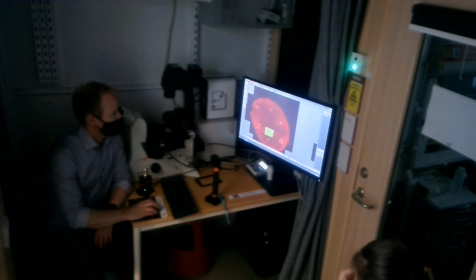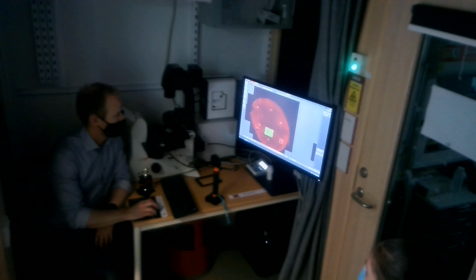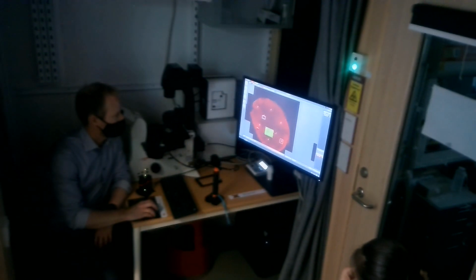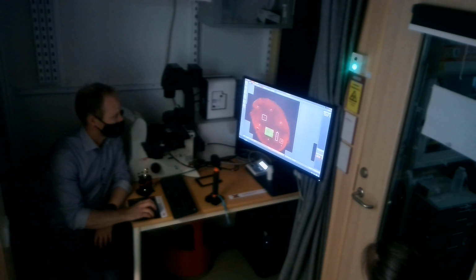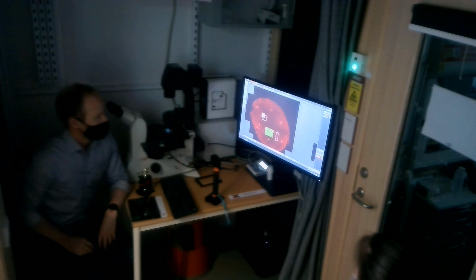Let's go back to the acquisition. So we have these two. I'm going to remove this and instead let's do two small ones here. Do one here, and we can do another one here. So now I have two of them. I will start this one also.